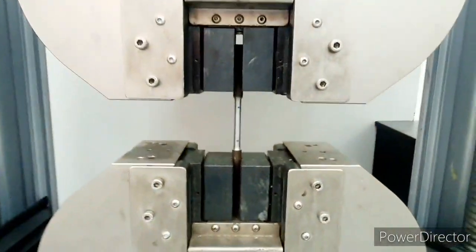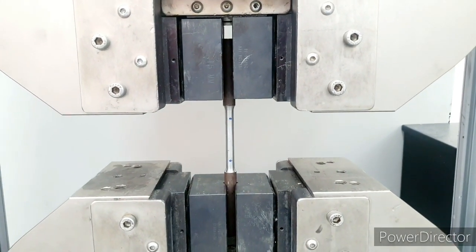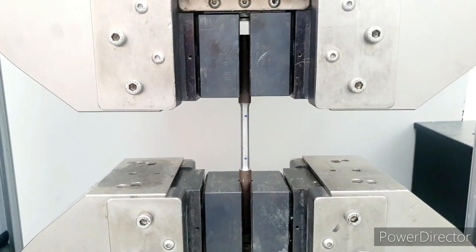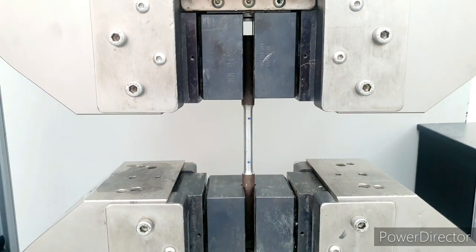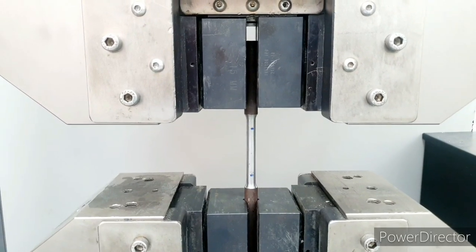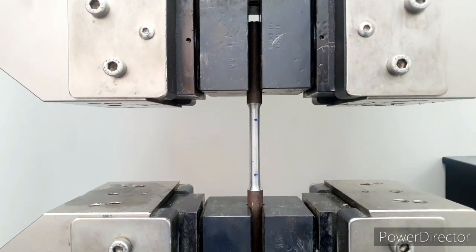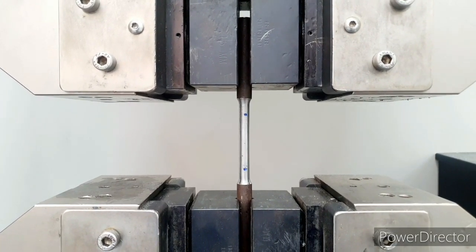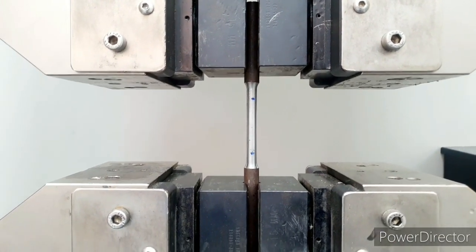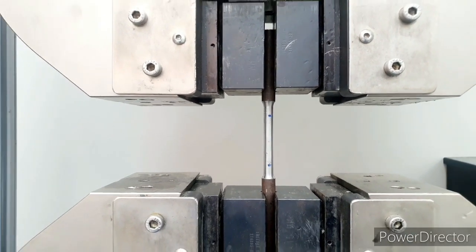And now it's good to see how the sample is behaving in the extension, and after some time you will see that the material is starting to reduce its thickness from the center, which is called necking. Okay, we will keep the video on and keep on seeing how the material is behaving. This is still being pulled.